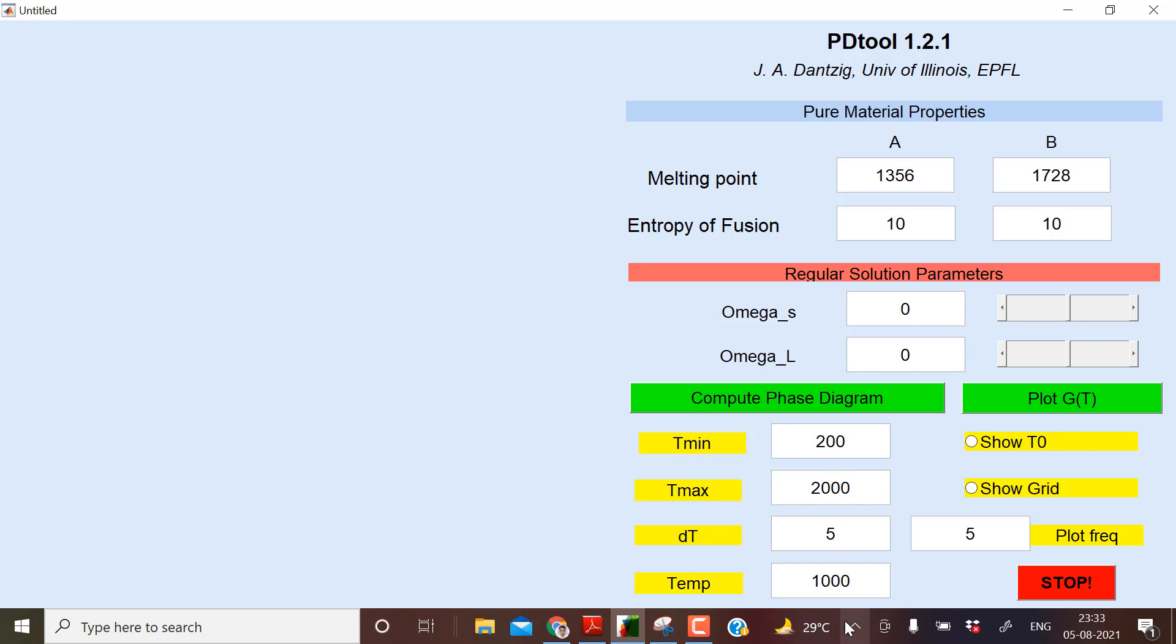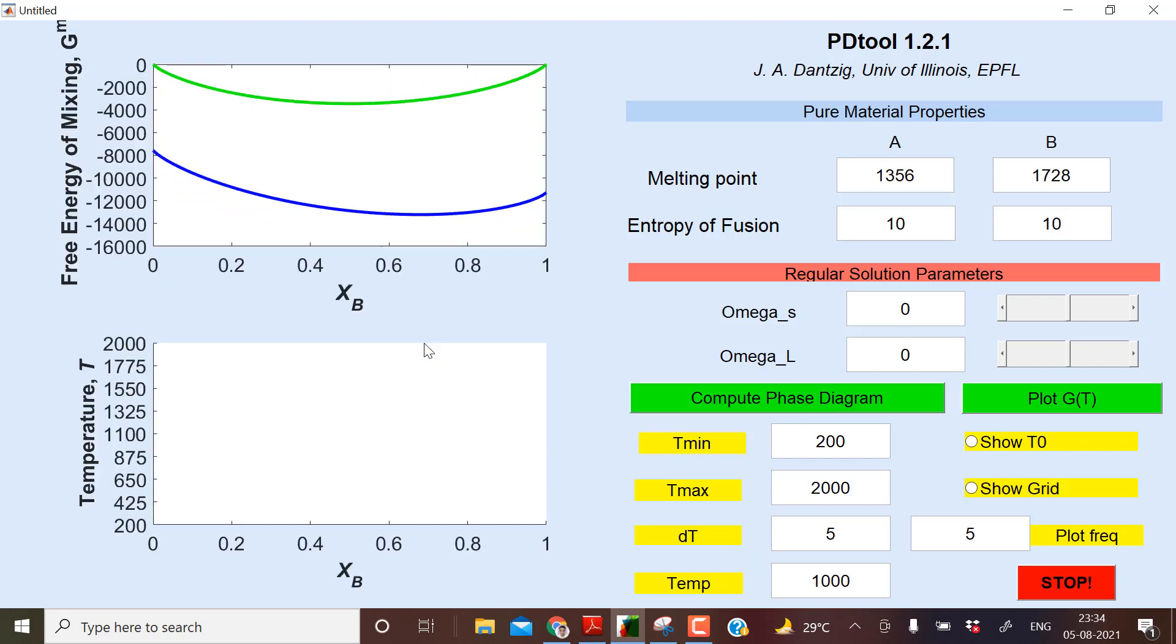And at what temperature you want this G versus T diagram? So let me decide right now, let it be at 1000. Now it is trying to calculate the phase diagram.